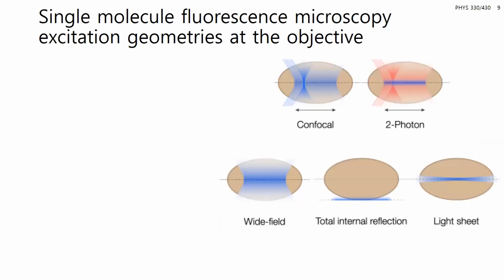So getting back a little bit to the instrumentation in fluorescence microscopy for single molecule, you can have single point geometries, or you're going to do one-dimensional detection. And we talked a little bit about confocal microscopy in the past. So in these cartoons here, this tan circle would be like your sample. Let's say it's a cell of interest. And with confocal microscopy, what is illustrated here is a focal volume that you focus at a single point. And you detect this on a 1D detector like an avalanche photodiode or the like.